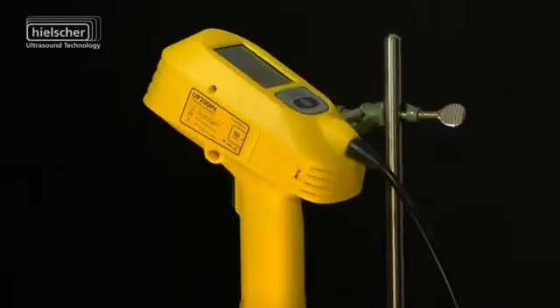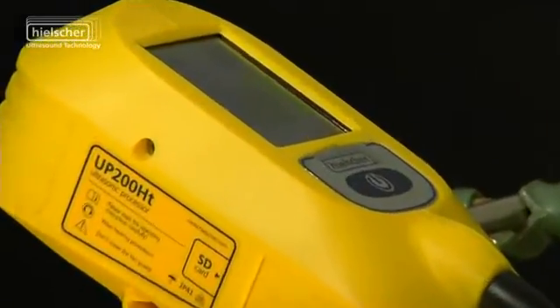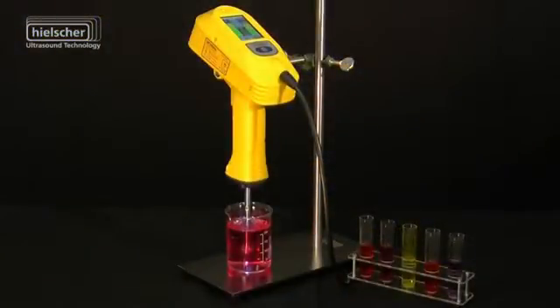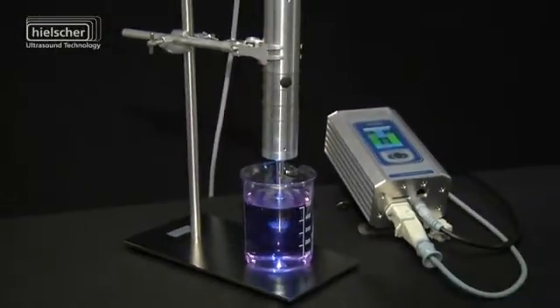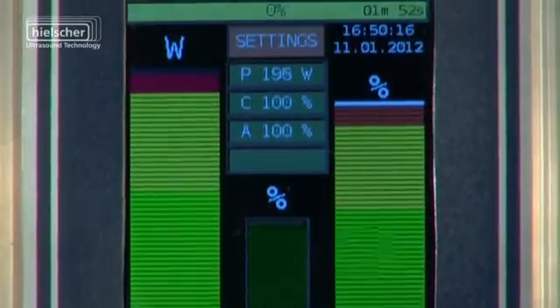Hielscher Ultrasonics GmbH, leader in the field of ultrasonics, presents the further development of its ultrasonic laboratory equipment series: the compact ultrasonic homogenizer UP200HT and the ultrasonic device UP200ST, conceived and built with separate transducer and generator.